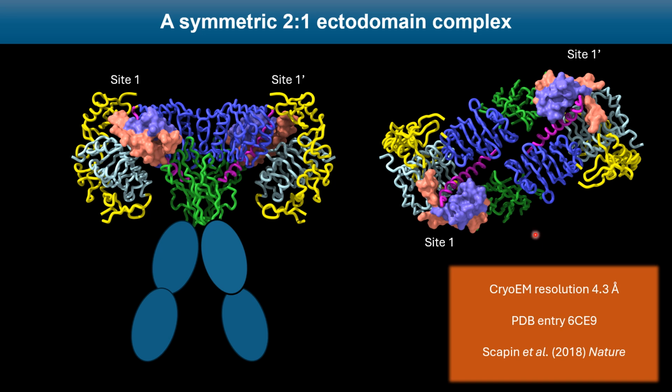The second remarkable thing is that the alpha-CT helix is much longer than we saw in our crystal structures. So there's a sort of supercoiling of that helix back down towards its linkage back into the alpha chain. The third point is that we now see insulin engaging the first of the fibronectin type 3 domains, the one in green over here, and there's this additional surface of insulin that binds to this receptor. So this was quite surprising, but there were a number of problems with this.